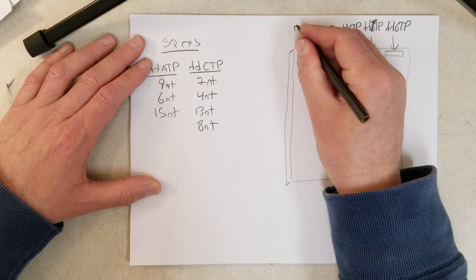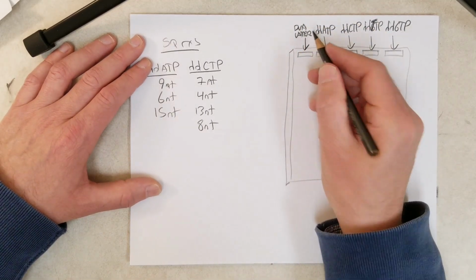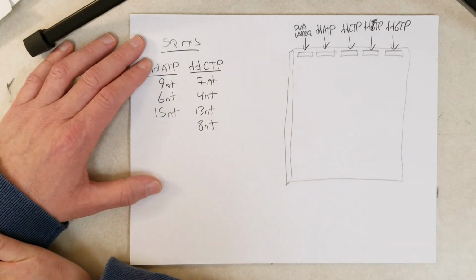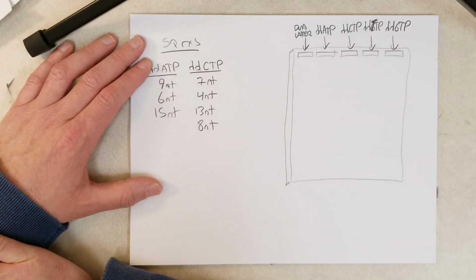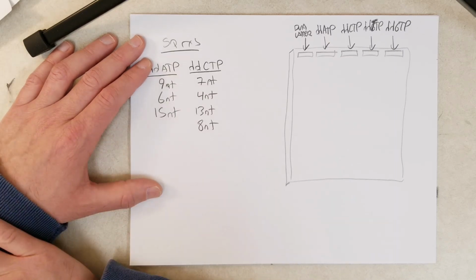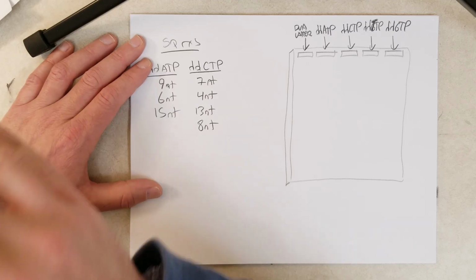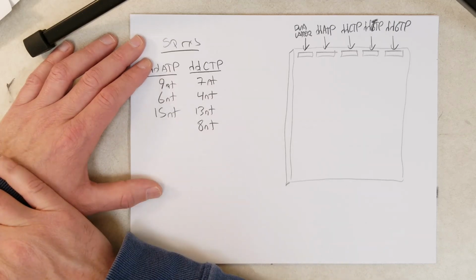Now over here, I'm going to put what's called a DNA ladder. You can buy a DNA ladder from a biotechnology company, and essentially it is a solution of DNA molecules where each molecule has a known length. The biotechnology company synthesizes the DNA so there is a molecule of a certain size over a size range in the solution.